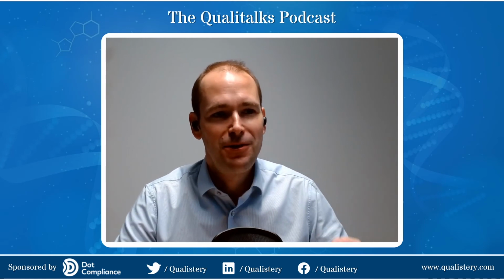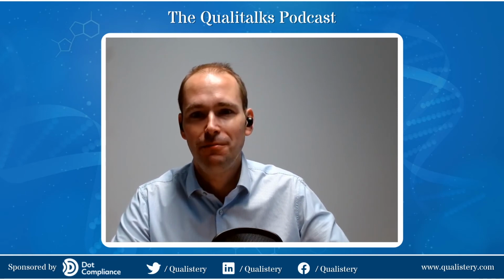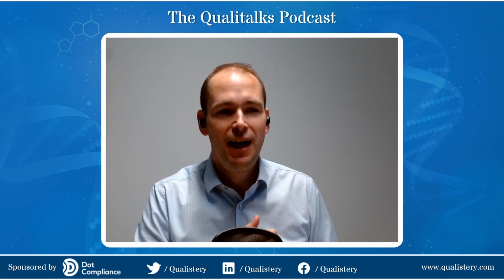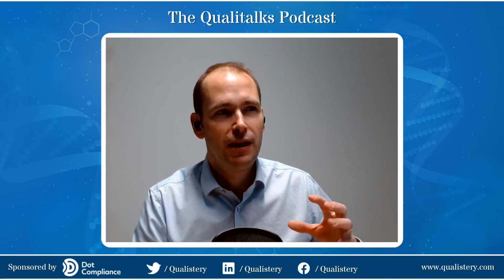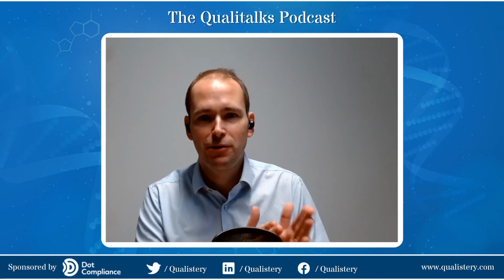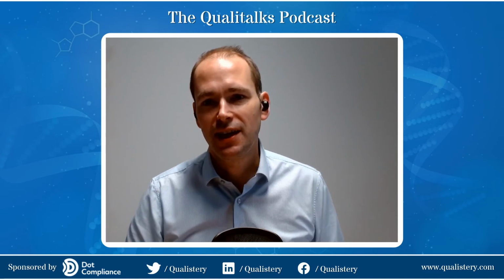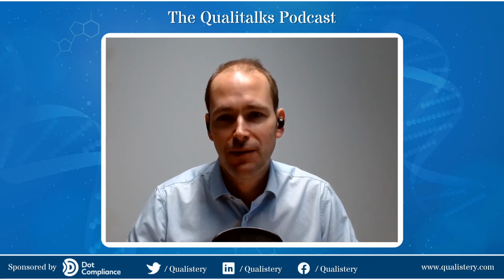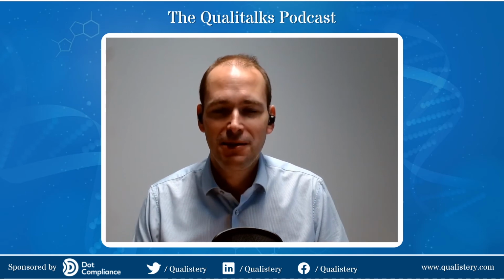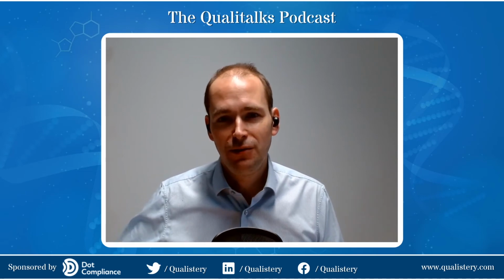But also it's about understanding any failures that you do get and understanding the implications of any changes that you make. And that's where we see a common pitfall. There might be an issue with the equilibration time, which I haven't really gone into, but it's part of the data that we're looking for to make sure that all of the temperatures within the chamber come up to temperature within the required time. So that's either 15 seconds or 30 seconds, depending on the size of the autoclave. But if that fails, there are various ways that you can fix it. But there is the right way to do it, and then there are other ways that can resolve the issue, but can lead to potential future issues.